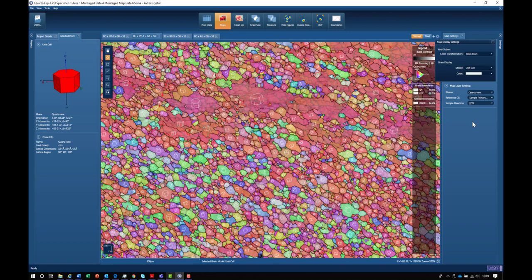This graphically allows us to view the texture or the orientations as represented by the colors. Once again, we can see that dominant preferred orientation of the C axis.